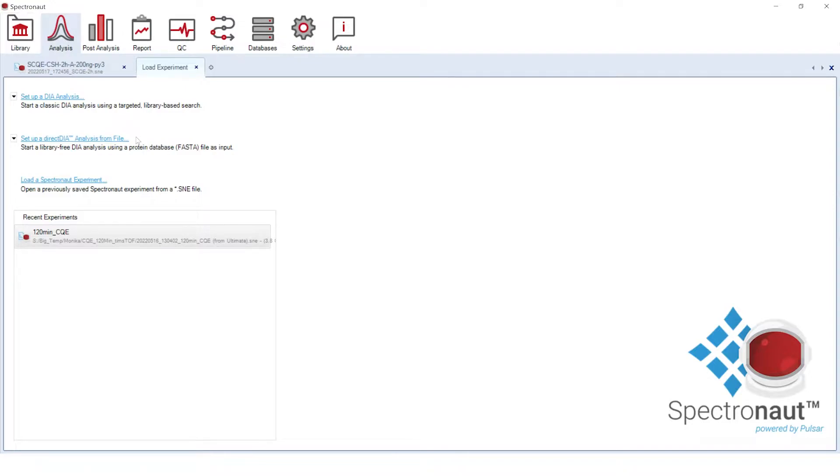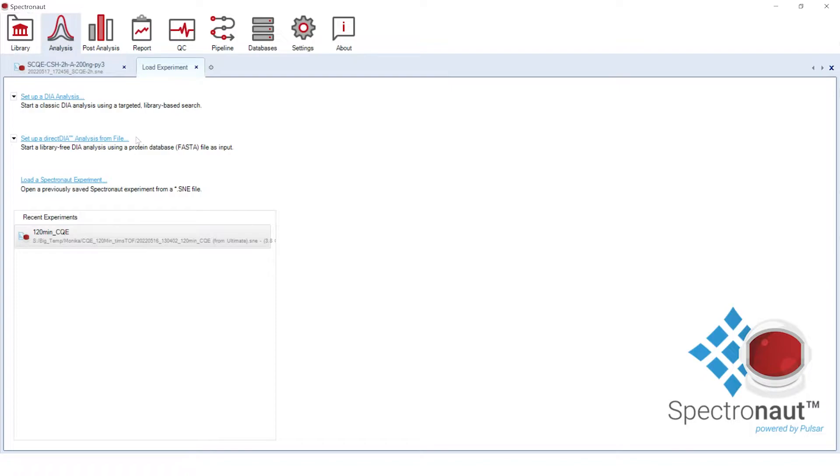Briefly, based on the DIA acquired precursors and fragment ion features as well as their retention time correlation, Spectronaut will generate deconvoluted MS2 spectra that will be used for the classical database search in Pulsar with selected FASTA files. After applying library filters, a DIA data derived spectral library is ready for the targeted quantitative analysis.